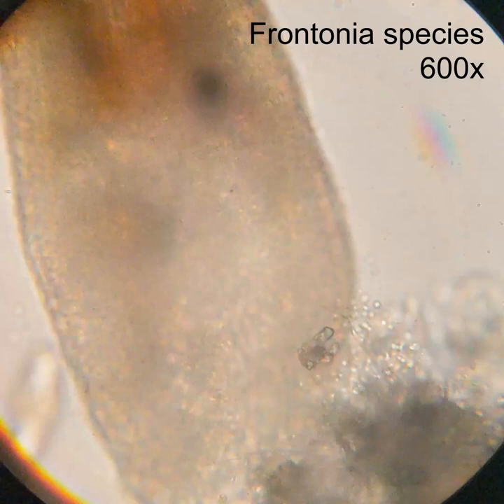Welcome back, everybody, to Microbe Peeps. Today we're going to be peeping at this little ciliate — I think some sort of a Frontonia species — and he has gotten himself into quite a pickle.